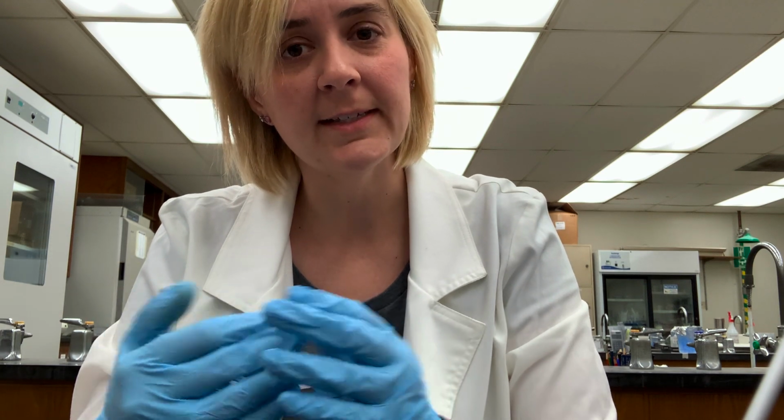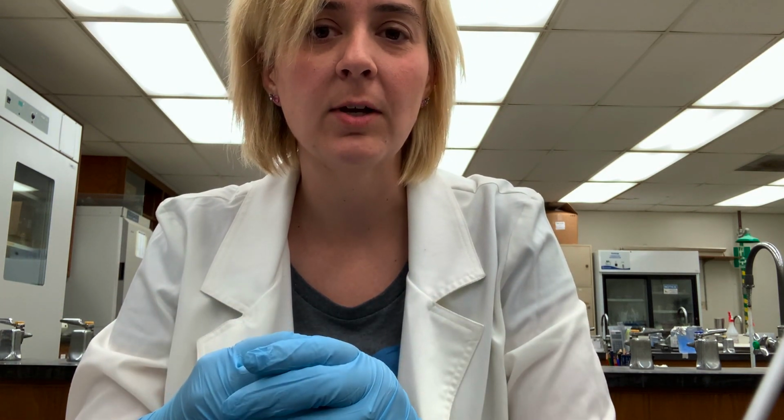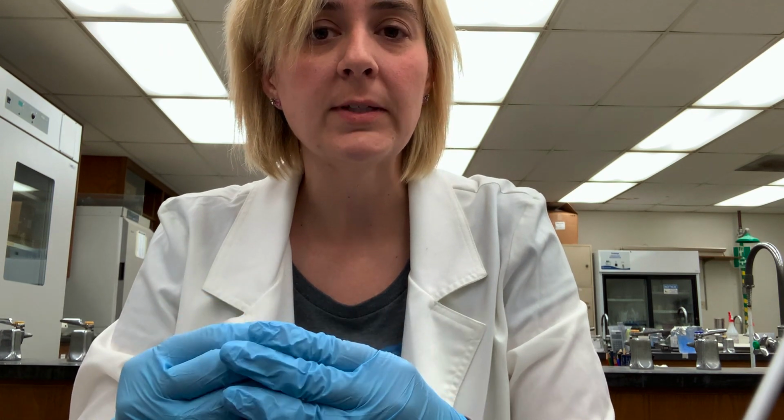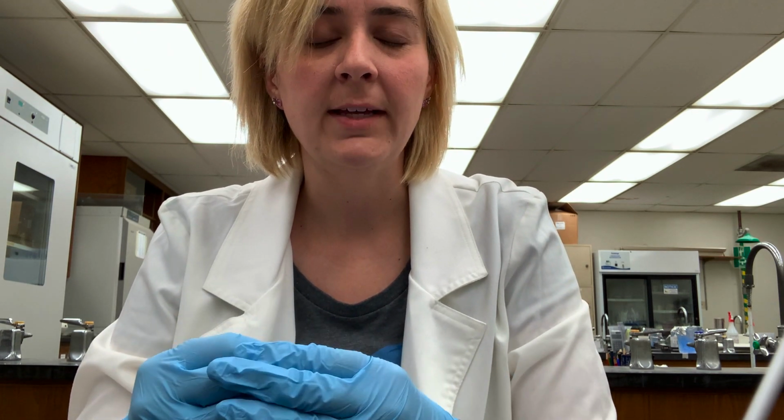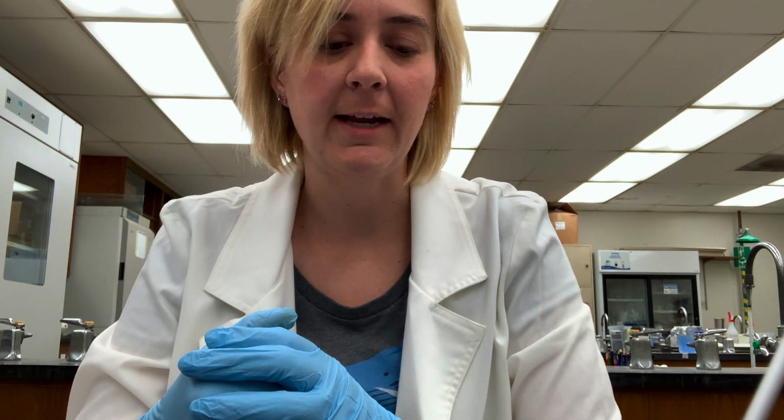This culture should be Klebsiella, the genus Klebsiella. So it will be a gram negative, but we won't be able to tell, right? Rod-shaped or bacillus-shaped cell. So hopefully what we'll see after we're done staining and drying the cell is a rod-shaped blue cell because we've done just a direct stain.